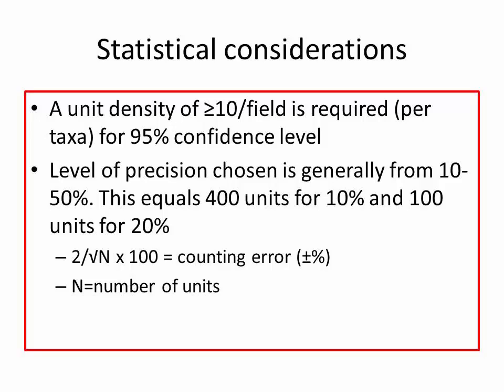Yes? Okay, sorry, I'm just getting a little confused because we were talking about calling a colony a unit, or no? Either way. And now you're saying, well, I guess what I'm thinking is that if you have a sample that doesn't have very much in it, well, then you're probably counting cells. Oh, I see. But if you've got so many that you want to count natural units, then it would be greater than or equal to 10 natural units. As long as the number you're counting is 10 or greater, whether it's cells or filaments or colonies. Does that make sense? Okay.